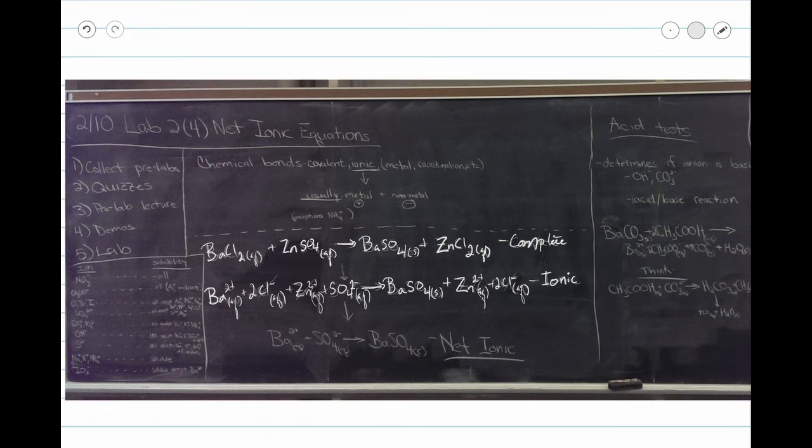Welcome to Net Ionic Equations. For this week's lab, we're going to be reacting ionic compounds together and learning about ionic equations and solubility.